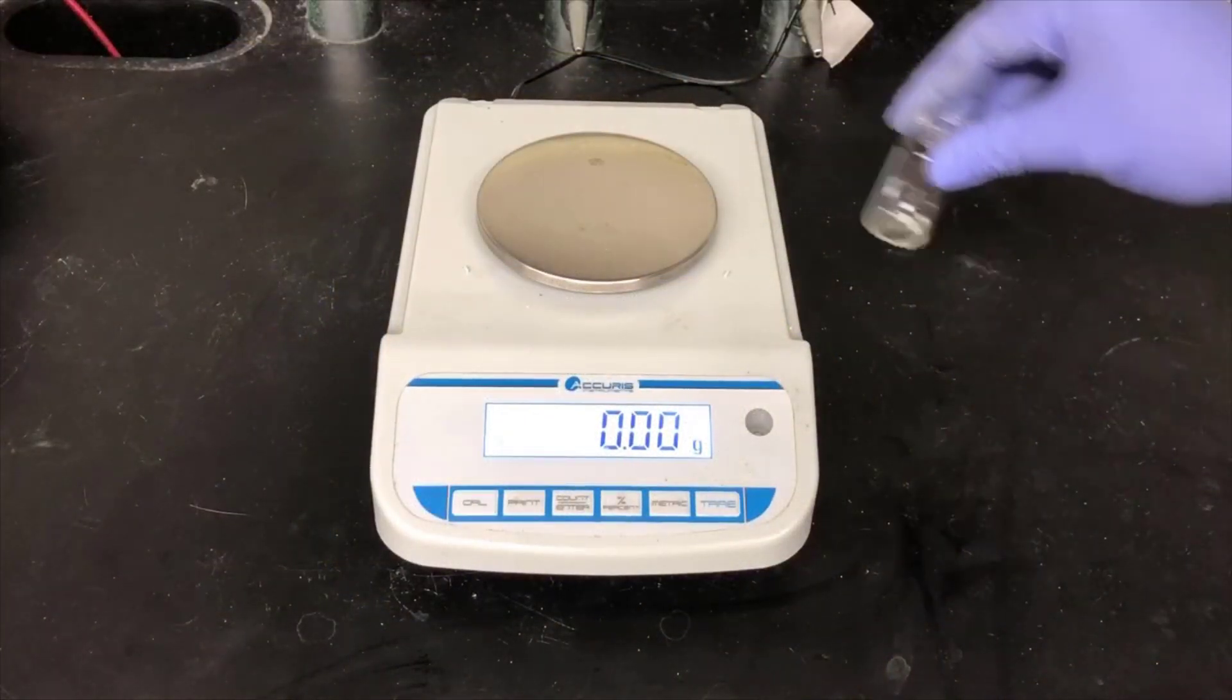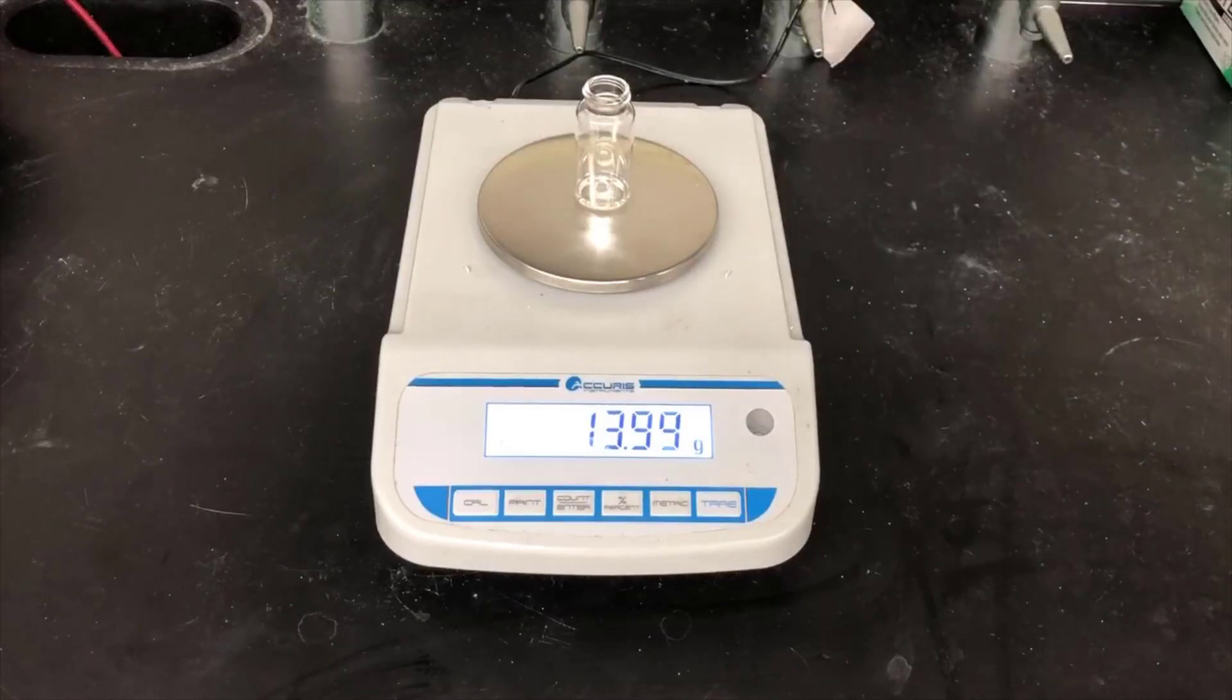Now I'm weighing the vial that contains the product. I can subtract the mass of the empty vial from before to get the weight of the product by difference.